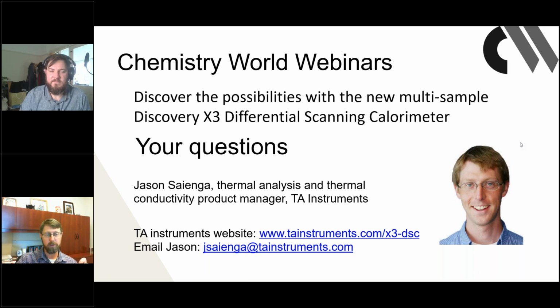And there is, I will say, ever so slight difference in the resolution that you get between the two systems. So if the materials that you're looking at have some polymorphic transformations, and you really need good resolution or good separation between peaks, you might want to consider the 2500 over the X3.